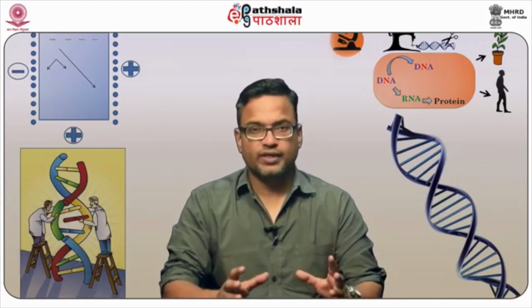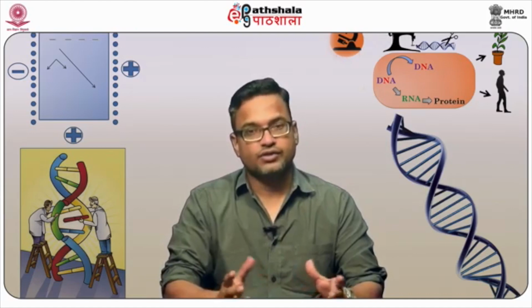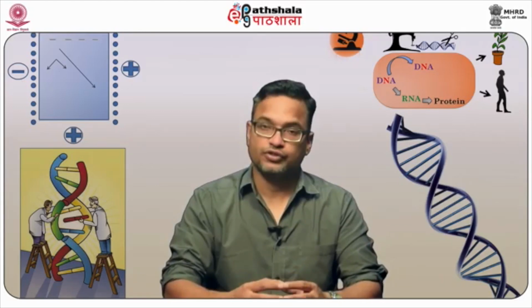So what is a microscope? A microscope is an instrument that allows us to magnify an object. Most of the things which we see through our eyes are in good, high resolution, but there are several things which we want to enlarge, especially in research, when we are trying to understand how a specific thing is constituted.